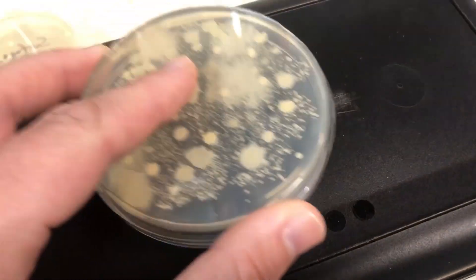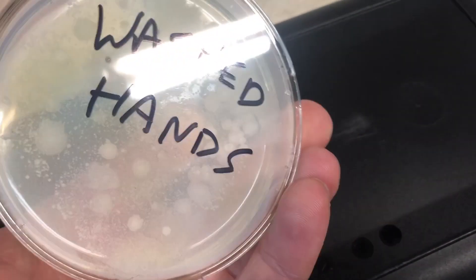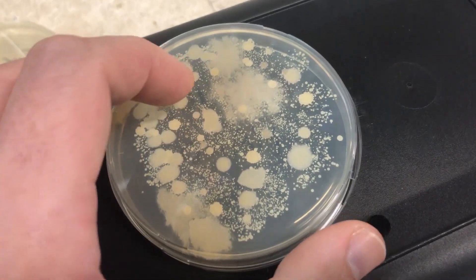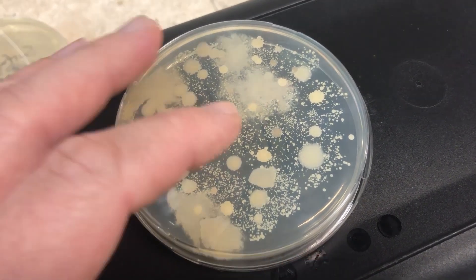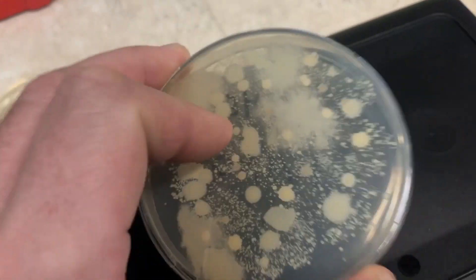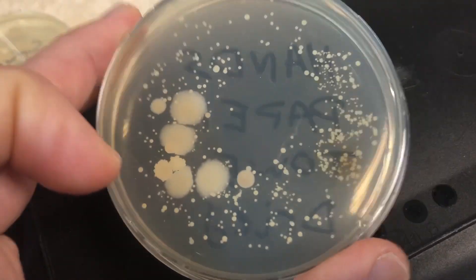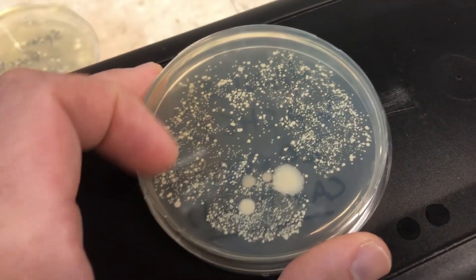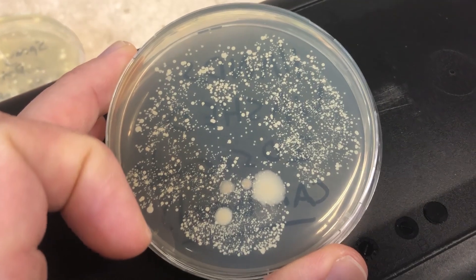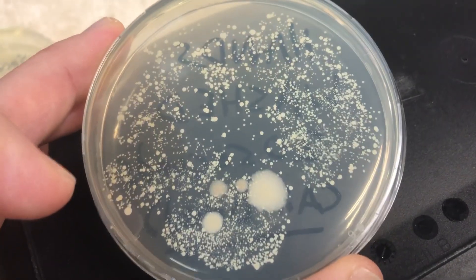Next is the petri dish where I washed my hands and air dried them — I didn't dry with a towel, just went from the sink, shook them off, and touched the dish. This was not a 20-second wash as recommended by the CDC, just a regular 5 to 10 seconds like most people do. You can still see a lot of bacteria even after washing. The next dish is from drying hands on the hand towel — still plenty of bacteria. The paper towel dish is next, followed by the dish from washing for 20 seconds — and you can clearly see there's still a lot of bacteria even after a proper 20-second wash.